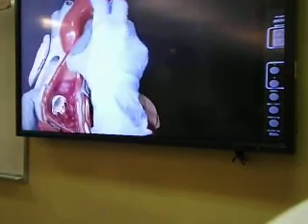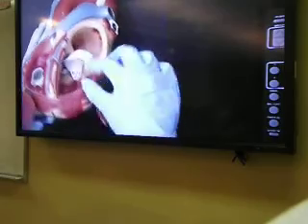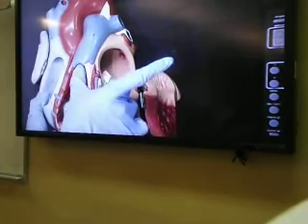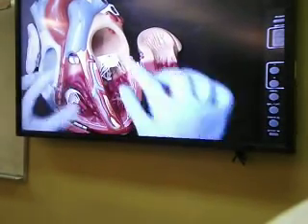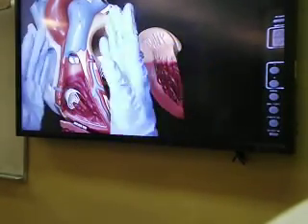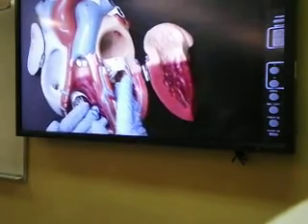So this is the pulmonary semilunar valve between the right ventricle and pulmonary trunk, that is closed, and the aortic semilunar valve between the left ventricle and aorta will stay closed when ventricles are relaxed. That's called ventricular diastole. And these valves will be open so that blood coming from the respective atria fills up the respective ventricle.